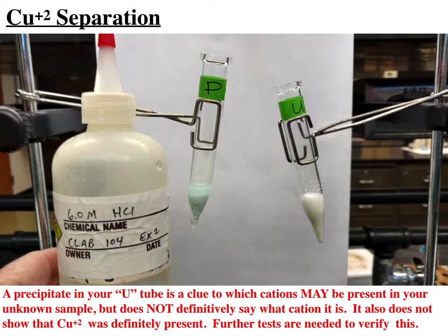What we don't know is if it has all of one and all of the other, or a mixture of both. And what else we don't know is, was there copper present? Because the copper was soluble with the addition of chloride. So if copper cations are present, they're still in the liquid or supernatant above the precipitate.